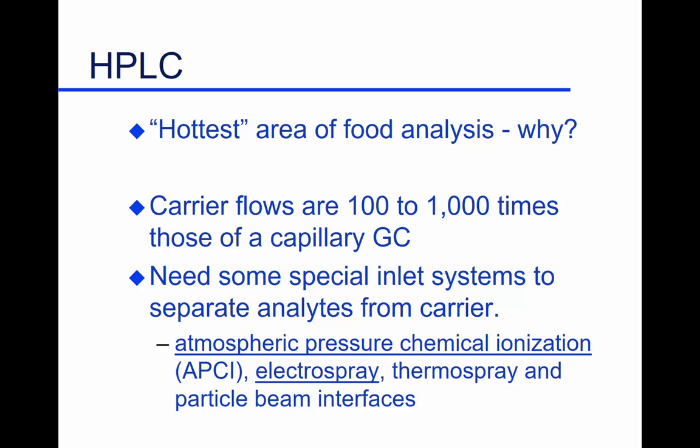HPLC, there's certainly a lot more going on in HPLC than there is in gas chromatography. And that's, as I mentioned before, for gas chromatography, it's pretty much mature. We found ways to interface these things. And so we've really got a pretty compatible system that works well for gas chromatography. We're still making progress in HPLC. So that area is still evolving. And once we get a lot of instruments that can do work for us quickly, they become much more broadly used. Once they become cheap, they become broadly used. So simply the idea of instruments becoming cost effective, again, brings them into the food industry. If you're going to pay $1 million, you're not going to have many mass spectrometers in a food company, believe me. If you say $100,000, yeah, we can buy one of those if they do something for us. So there's a real difference, and cost has been an important one.